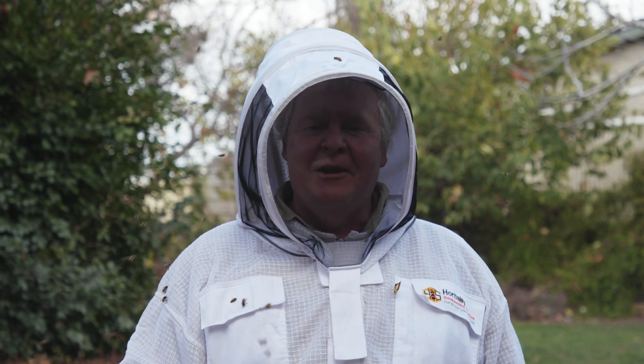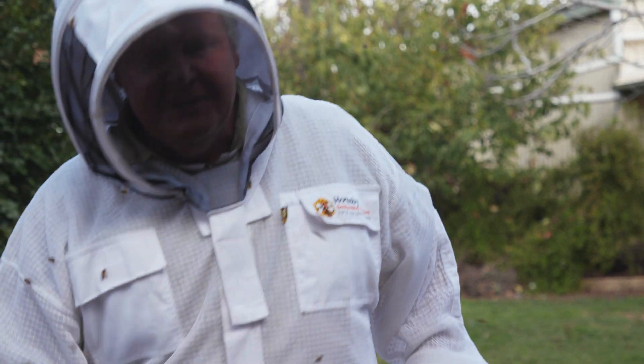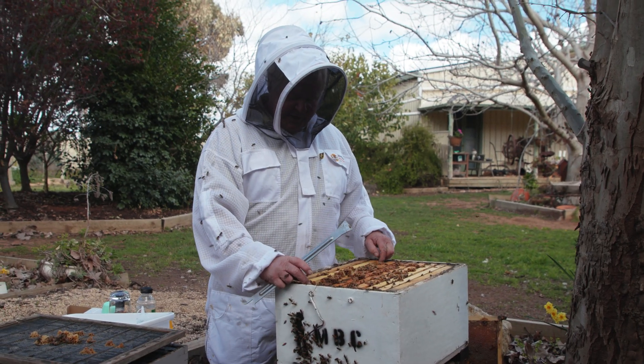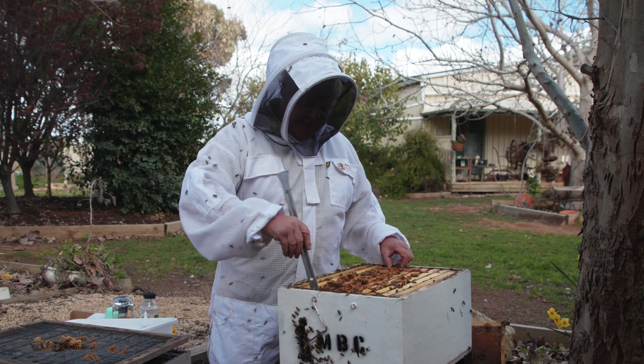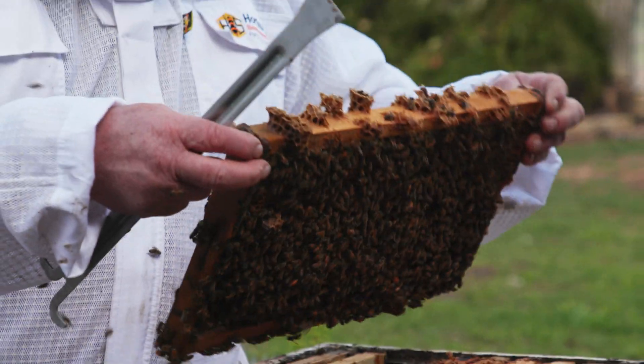I'm hoping right now that I don't have any mites to show you in this process, but if you're down here in Oz, this is what you need to be doing. Everybody's gonna have to play their part to find out where these little girls are and how quick they can spread. I'm guessing that calculation's above my pay grade — to work out how quick they can spread across the countryside.